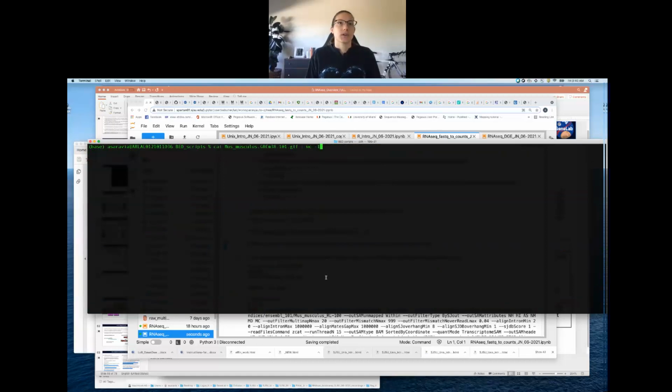And so I found some awk commands to be able to pull out specifically that term gene_id and print the phrase that comes right after it, which of course is going to be the Ensembl gene ID. And I pipe it into the head function, which I have here at the end.